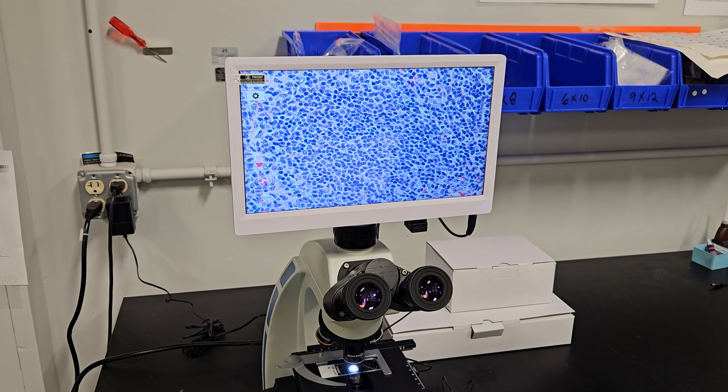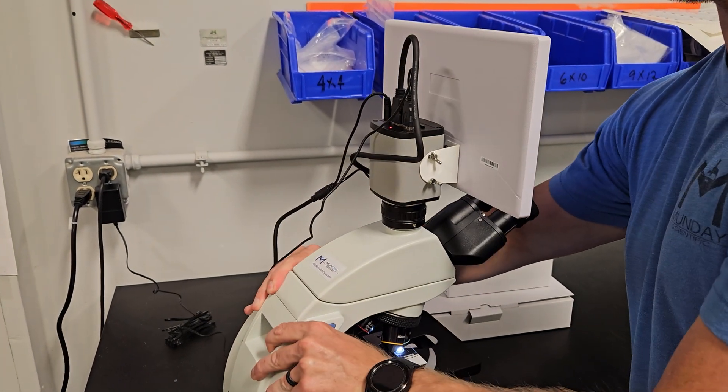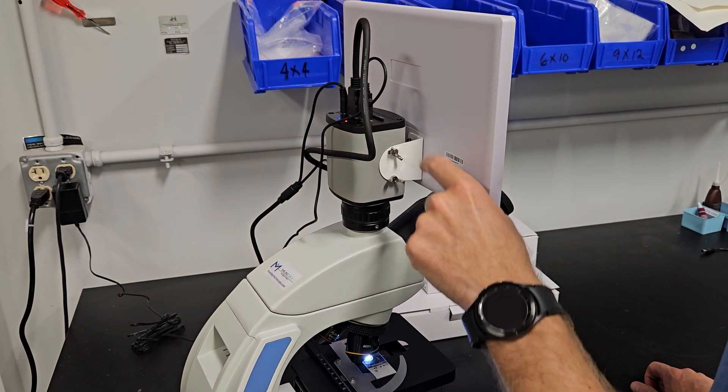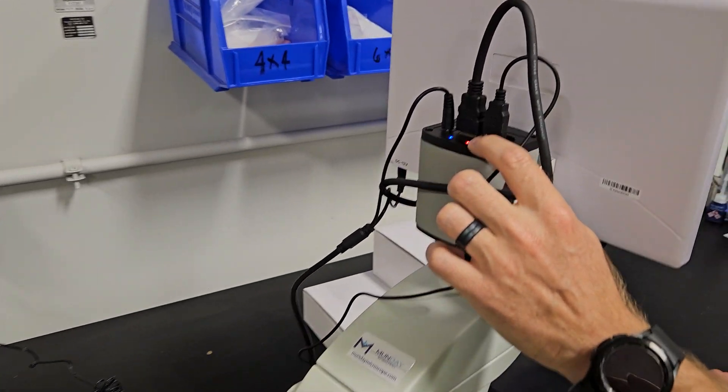And you have a couple of buttons here we'll talk about on the back when you hook it up. You have the on and off button that you'll have to hit whenever you turn the scope on. When it's getting power this light will be red.